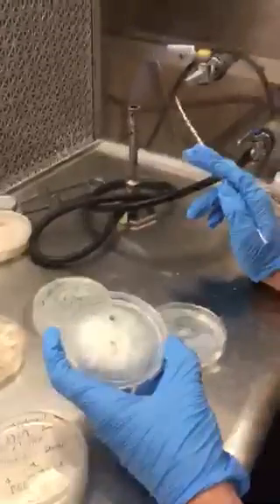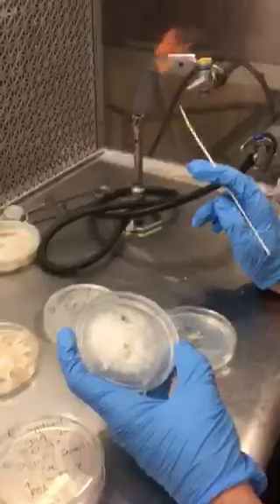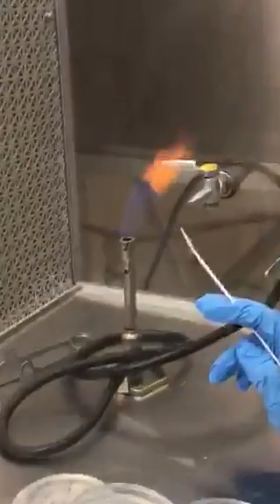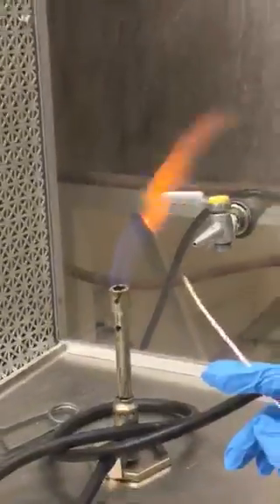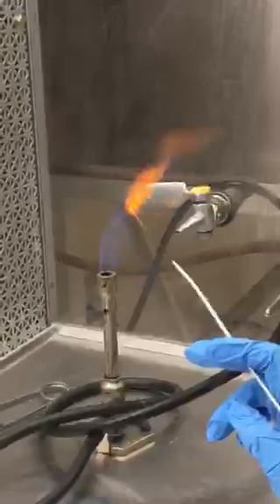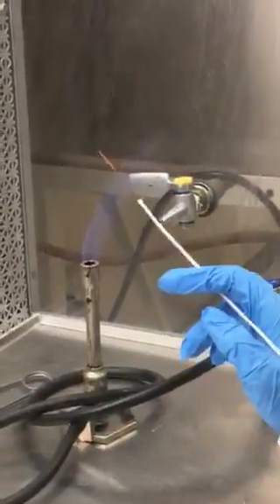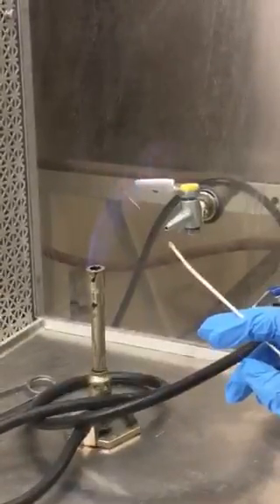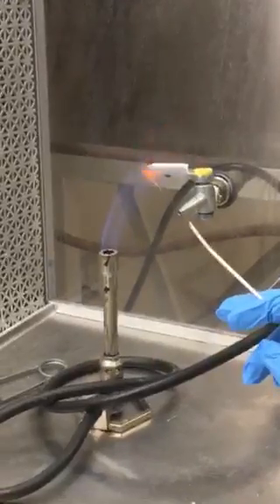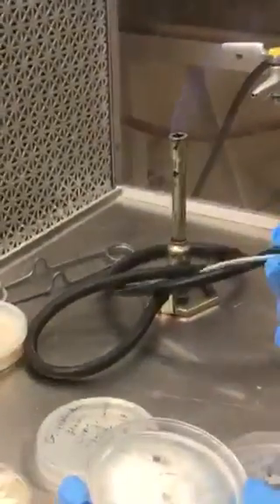The methods required for sampling — typically you flame your tool. In this case I'm using an inoculation loop; it's a steel-tipped loop. This whole region is pretty much just metal, so it can flame fairly easily — convex the flame, or the heat, rather.